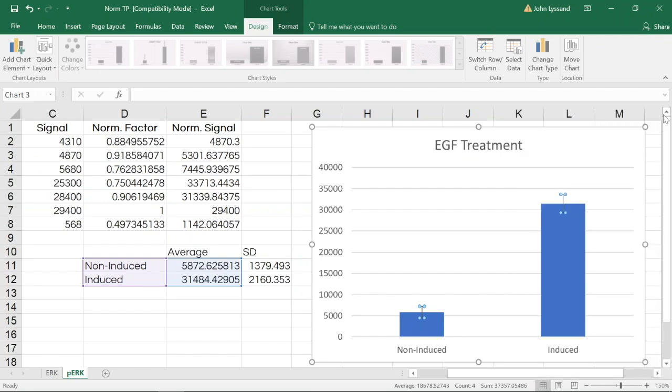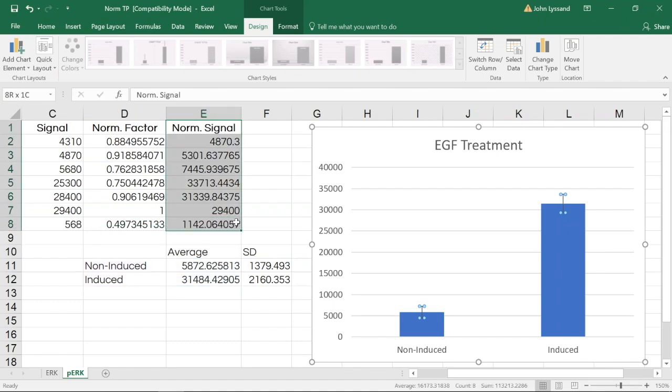Working forward as we do further analysis of this experiment and of these targets, we'll always want to make sure we're using this normalized signal.